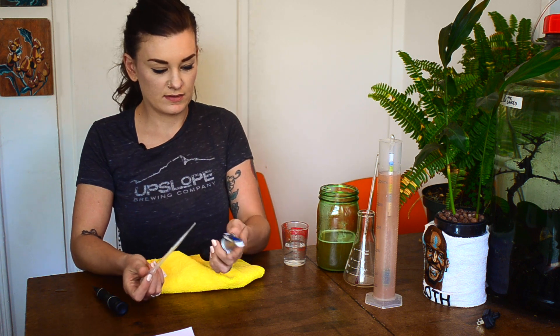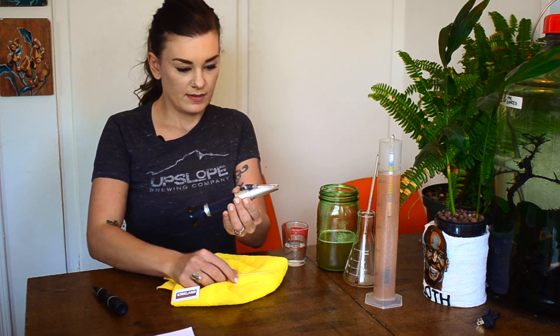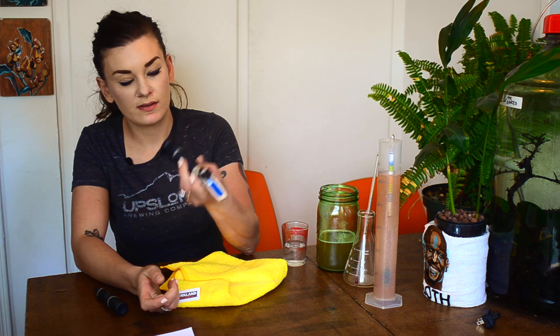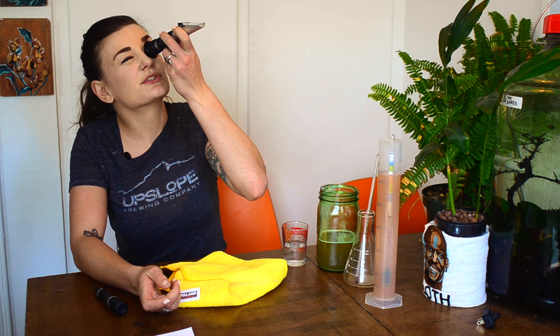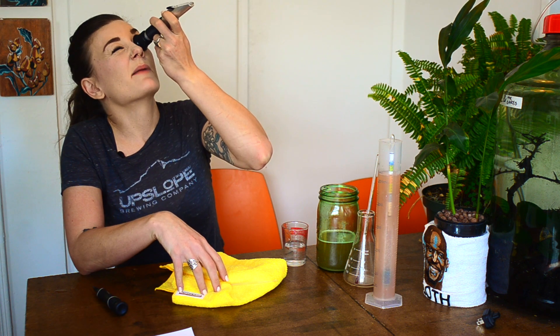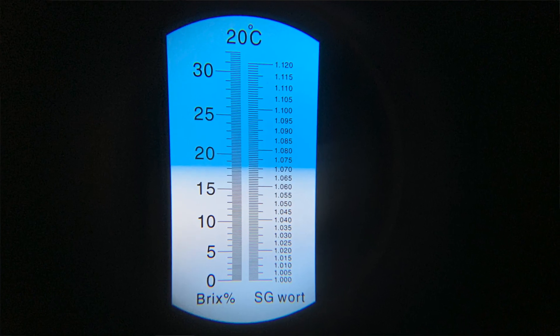Just put a few drops on, close the little plastic top, and let it sit for about 30 seconds. It works best if you point it at a light. You always want to read Brix when using a refractometer because SG and Brix aren't linear, so the SG shown on the refractometer is probably wrong. Take all readings in Brix and then convert them to specific gravity. My Brix reading is 17.3.